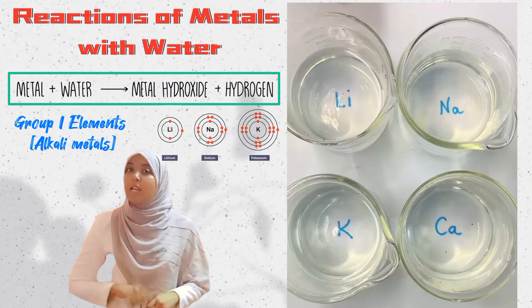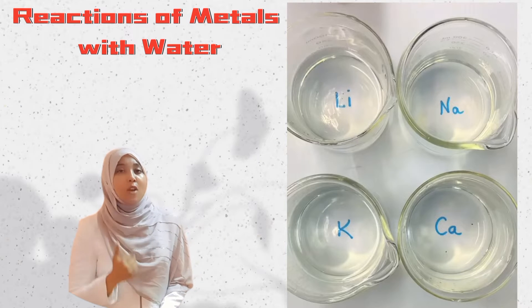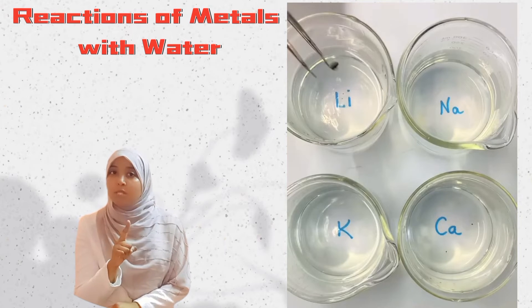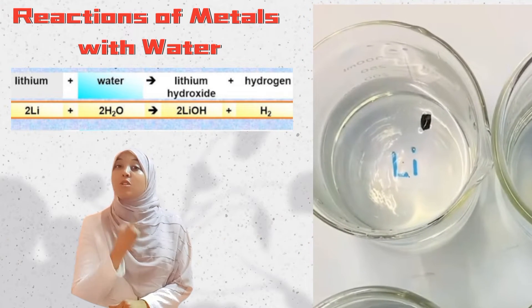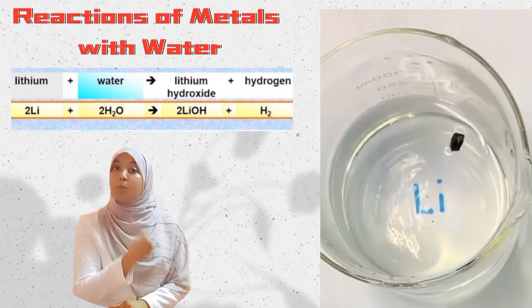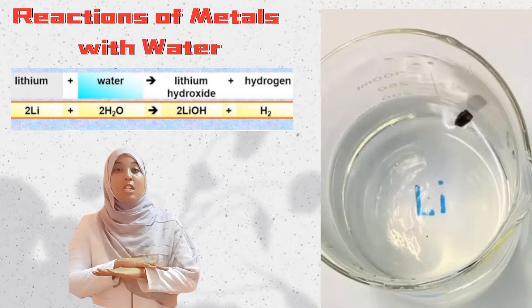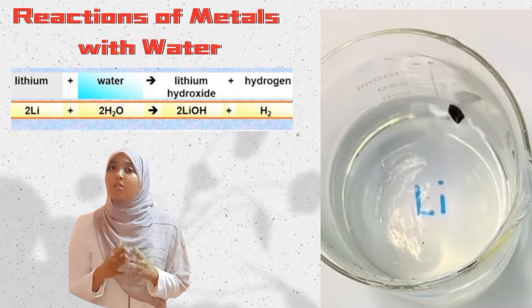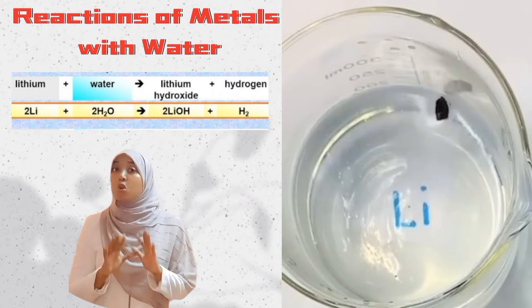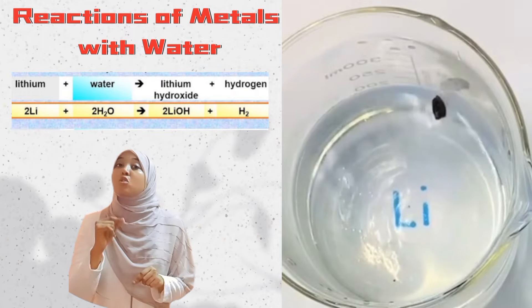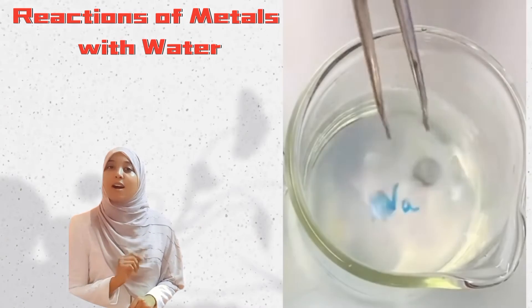Let's test it out. Let's add a piece of lithium to the first beaker. What do you observe? First, the lithium metal is floating on water because lithium, like sodium and potassium, is less dense than water. That's why they float above water. Now look at the rate of the reaction. It's slow—not as slow as other metals, but slower compared to sodium and potassium.